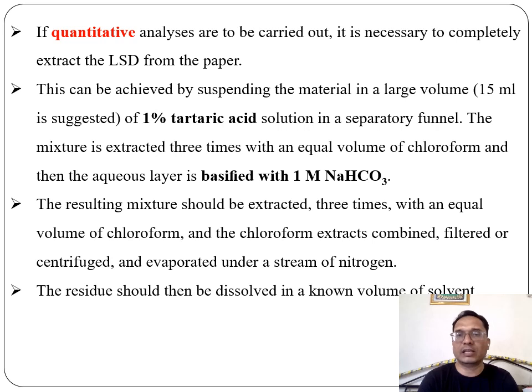This can be achieved by suspending the material in a large volume of 1% tartaric acid solution in a separatory funnel. The mixture is extracted 3 times with an equal volume of chloroform, and then the aqueous layer is basified with 1 molar sodium bicarbonate. The resulting mixture should be extracted 3 times with an equal volume of chloroform, and the chloroform extracts combined, filtered or centrifuged and evaporated under a stream of nitrogen. The residue obtained after extraction and evaporation should then be dissolved in a known volume of the solvent.